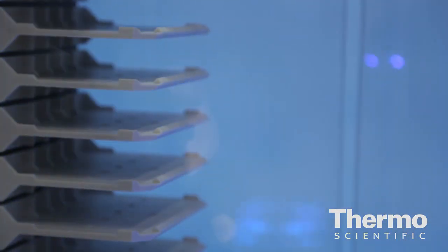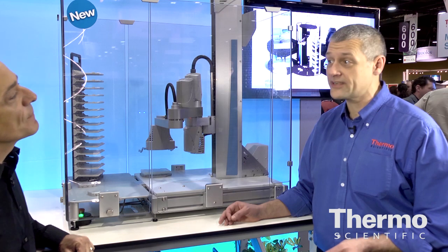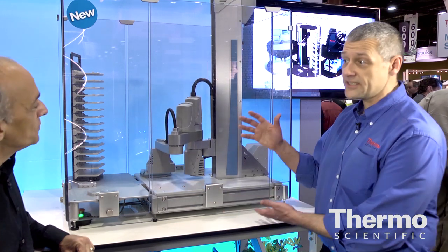The storage can be configured to work on any of the three sides. You can actually put carousels onto this and you can process 1,280 microplates and still have space for your instruments to work with.